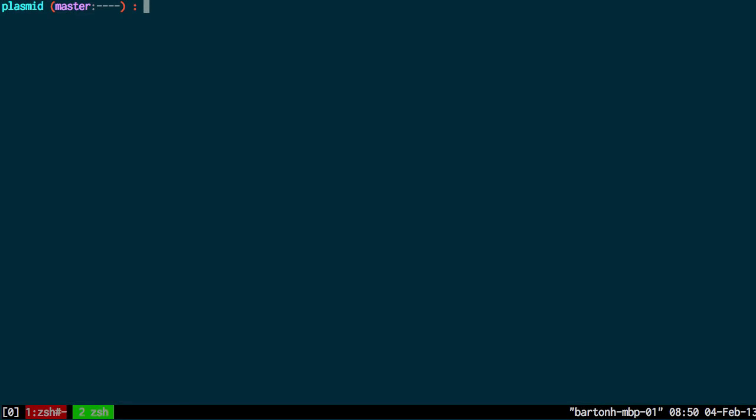In this screencast I'm going to give an example of generating a simple submission file to submit a plasmid sequence to GenBank and I'll be using Genoma for this example.